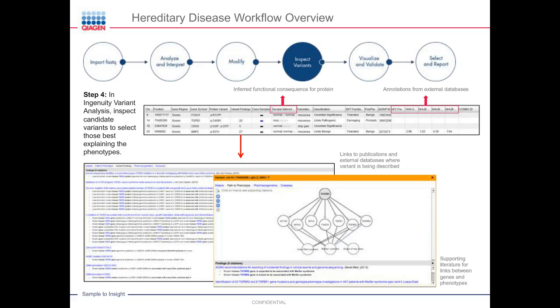Okay, and then the follow-up question, which I think you just touched on, is how is your list of thousands of variants reduced to less than 10? Yeah, so this is really how it comes in. There are two reasons it can be reduced to less than 10.